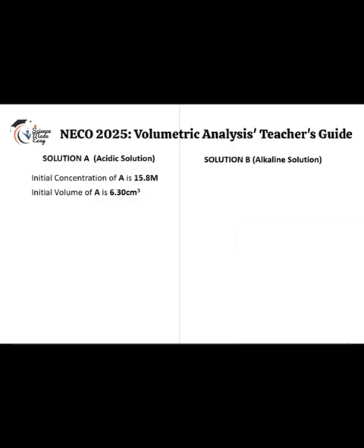Now recall that solution A has already been given, and the initial volume of solution A is 6.30. Therefore, V1 is 6.30. We are expected to make it up to 1000 cm³, which implies that V2 is 1000 cm³. On the other hand, for concentration of solution A, which is nitric acid, the initial concentration is 15.8 molar, and you can check this on the internet, while the concentration which we are expected to look out for is C2. Therefore, C2 is unknown.